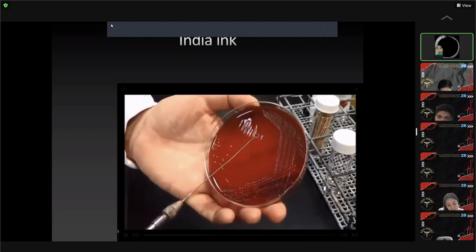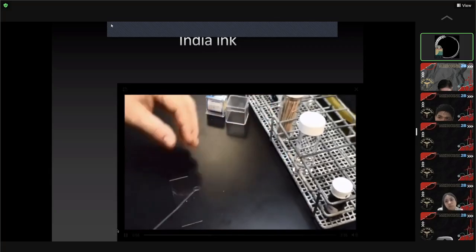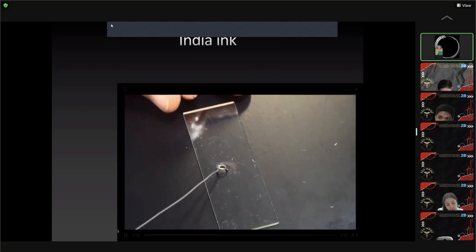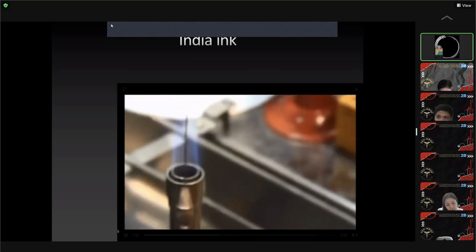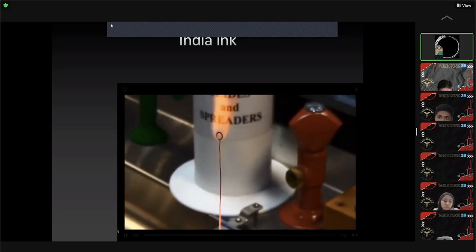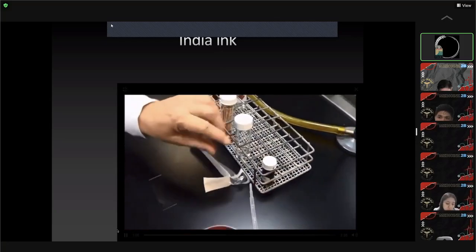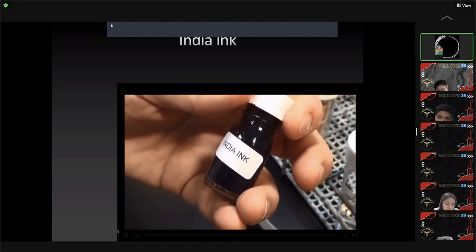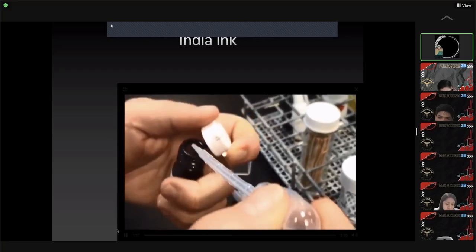To the naked eye, the suspension should be barely visible as cloudiness. A cell suspension that is too dense will make it difficult to examine the cells. Re-sterilise the loop. Add an equal volume of India ink to the yeast suspension, using a drop from a plastic transfer pipette.